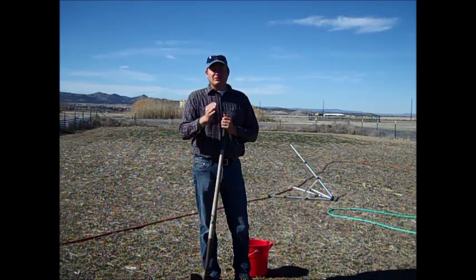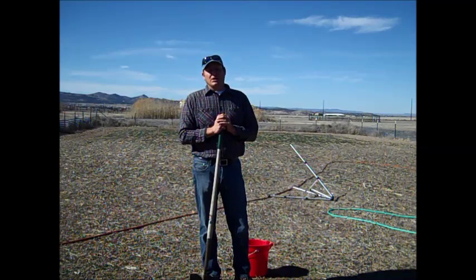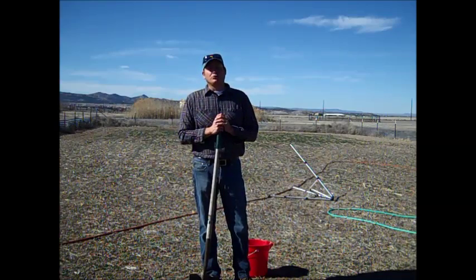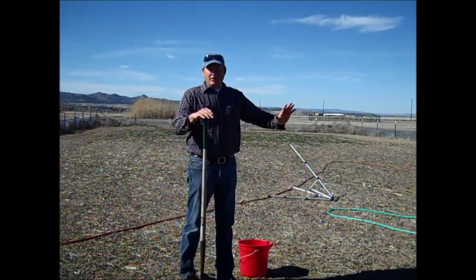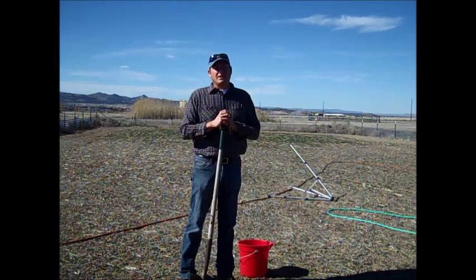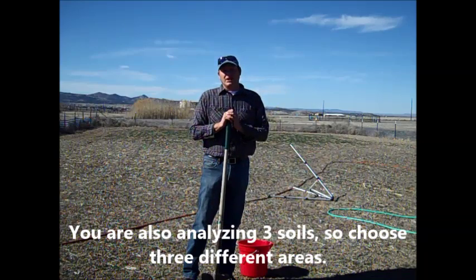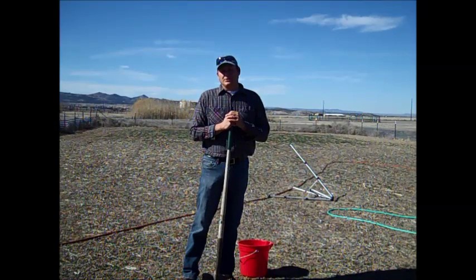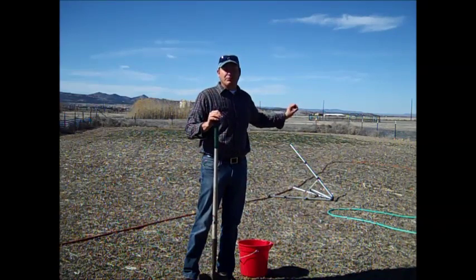There's three components: sand, silt, and clay in every soil. I'm going to help you triangulate and figure out those three different components in the soil you have currently, and then the practice of how to amend those soils. You don't want to just take a sample from one spot. If this is my area, I want to take multiple samples around the place to make that uniform and take out any variability, this spot compared to that spot, especially if it's raw ground. If it's soil that's been used, we've had this research garden going here and amended for about 3 years now, and so it's pretty homogeneous throughout, but I'm still going to take samples from different places.